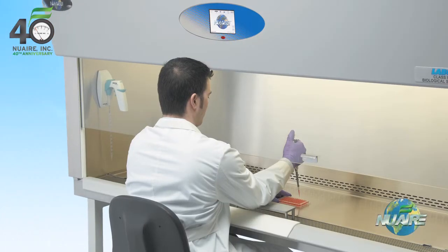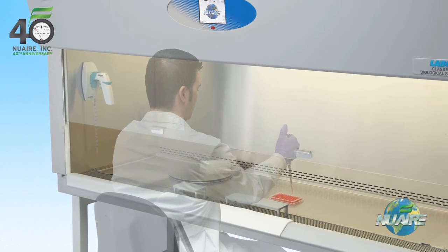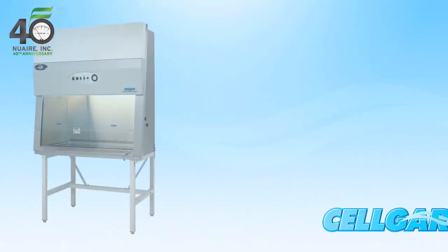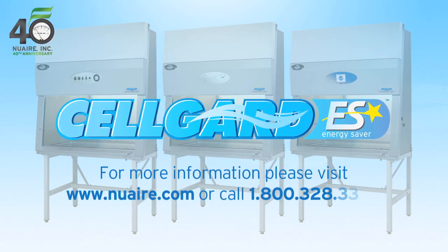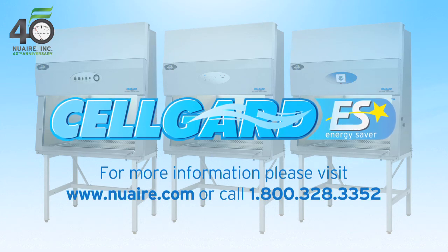Cool white lighting, frameless edge sash, and brushed stainless steel finish reduce glare and reflections, increasing sight lines into the work zone. Each cabinet is custom-built to your exact order. CellGard ES allows you the ability to create the perfect biosafety cabinet for your specific application needs.